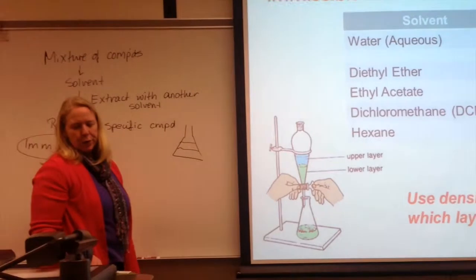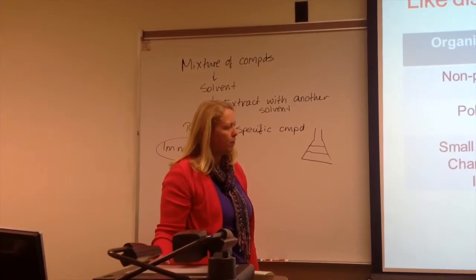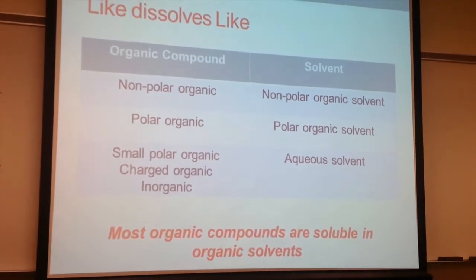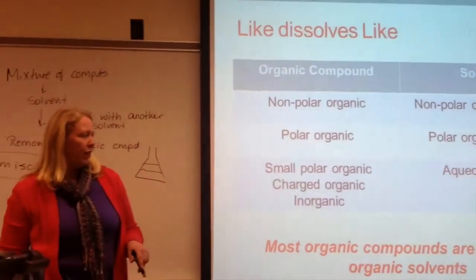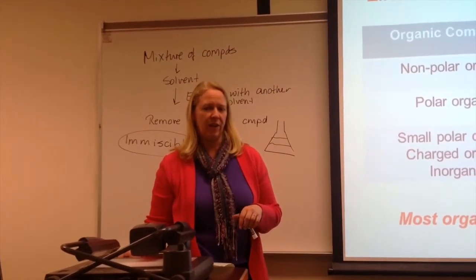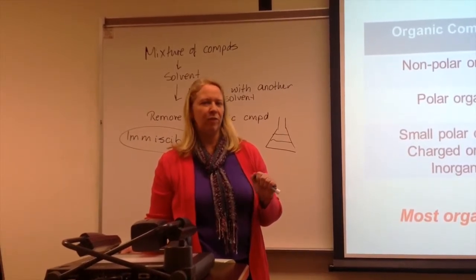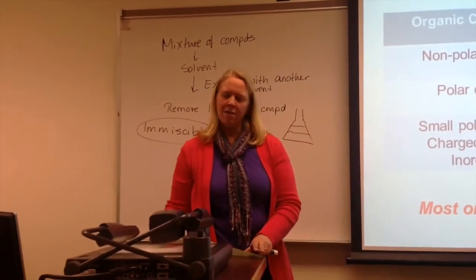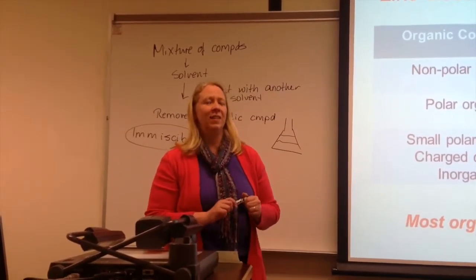So in the previous slide, the statement that I had on there, right here, is that most organic compounds are soluble preferentially in organic solvents. And that is true. However, there are a few organic functional groups that we can manipulate so they become more soluble in an aqueous environment. I don't know if you remember from the chemistry we've learned so far for organic compounds, what do you think those compounds could be? Aldehydes? Not aldehydes. Acids? Carboxylic acids? Carboxylic acids and amines, exactly.